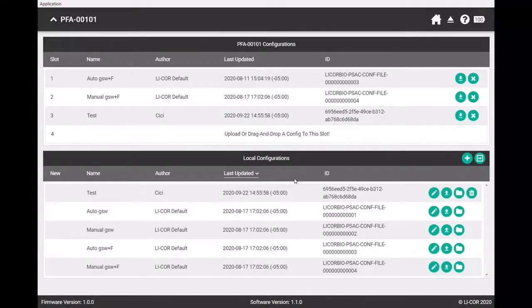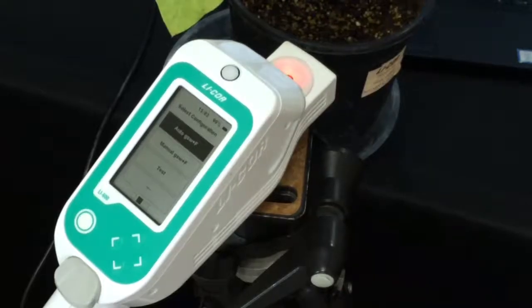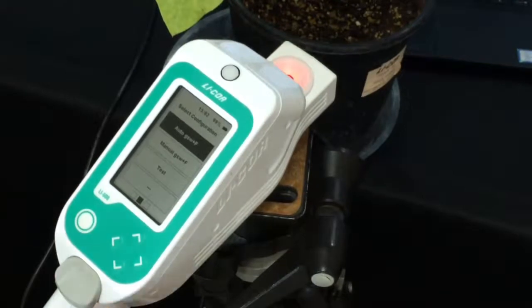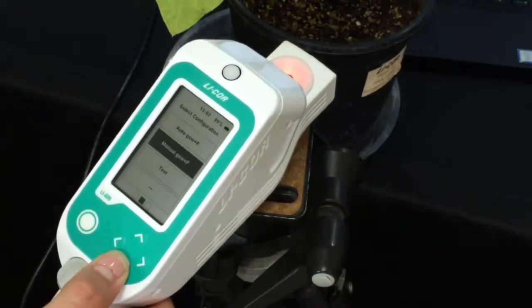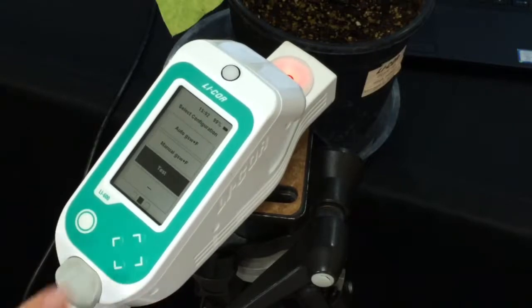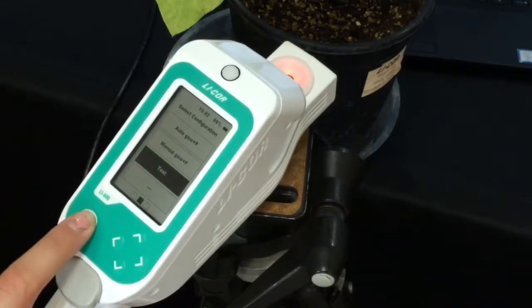Okay, so now we are ready to take our instruments and go and make our measurements. So now we're ready to make our high throughput measurements. We're going to go down and select the new configuration that we just created named test. So push enter.